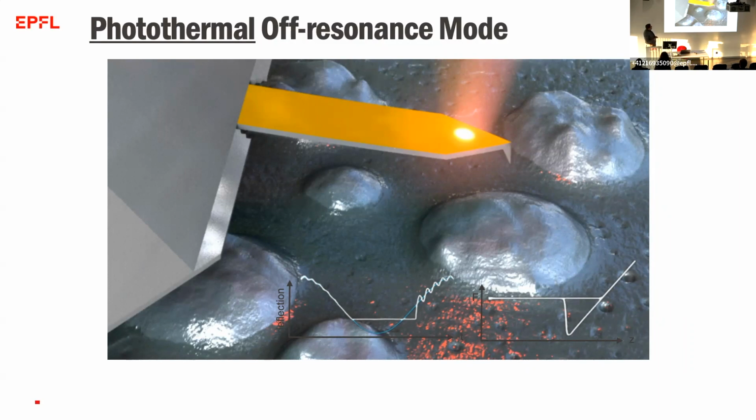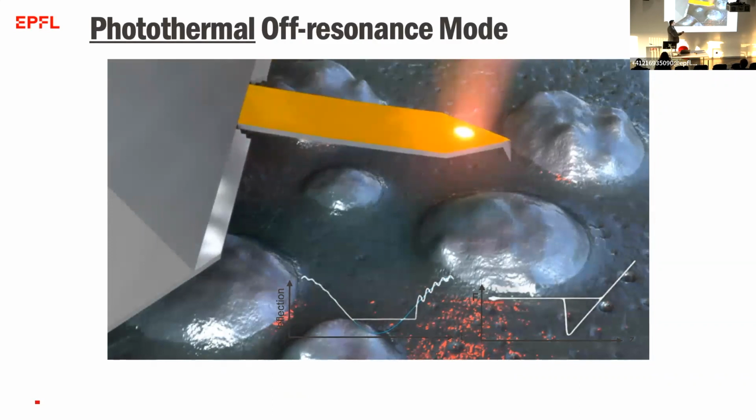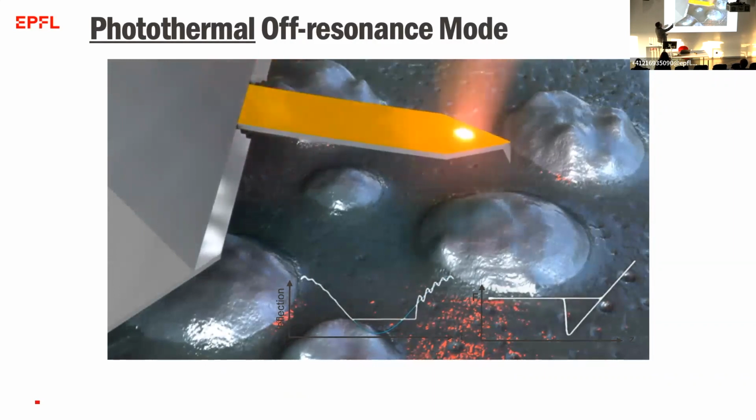And so what they did is to add an additional laser source into our AFM that is focused on this cantilever. So this was this probe that you saw scanning earlier. The first laser spot at the front is very standard. We need that one to actually measure the tip-sample interaction. But then they've added another laser spot at the back that is there to actuate it. Because it's a very, very small MEMS device and consists of silicon nitride and a metal layer on top.